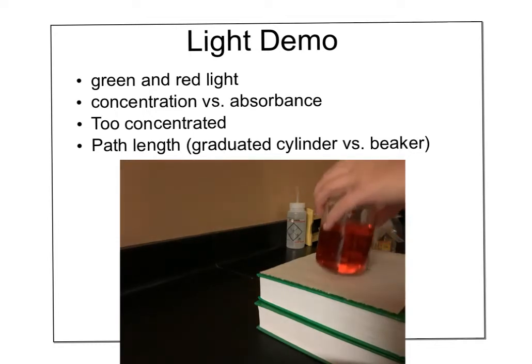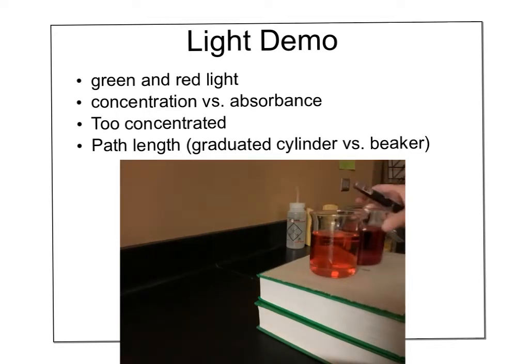So you can see between the two, less concentrated, more concentrated, I think I see a slight green on the wall, but not much. So when we increase the concentration, we greatly increase the absorbance. And in fact, in our lab, we have to be careful that our solution's not so dark that it absorbs all the light. Otherwise, we won't register anything on the other side.